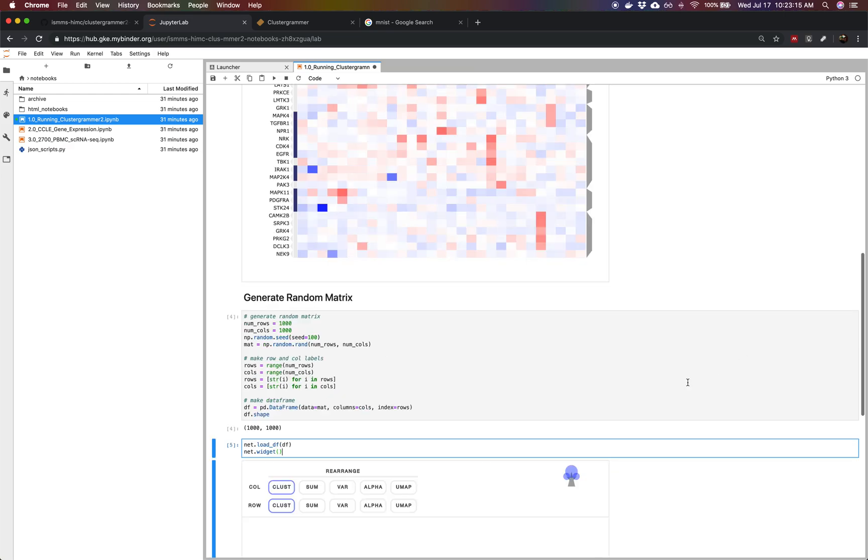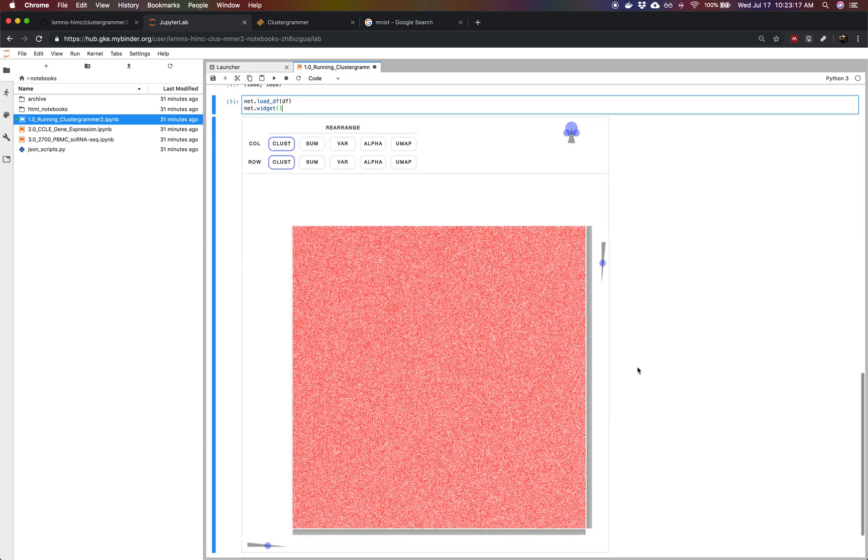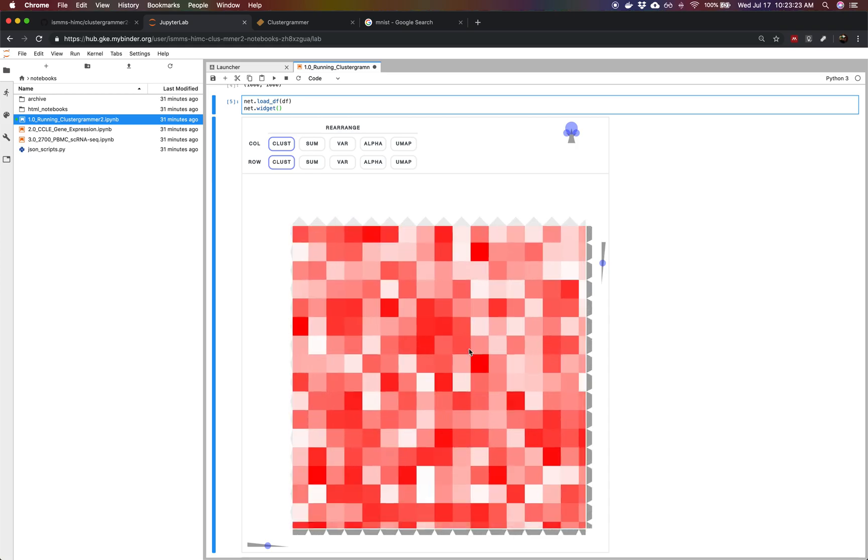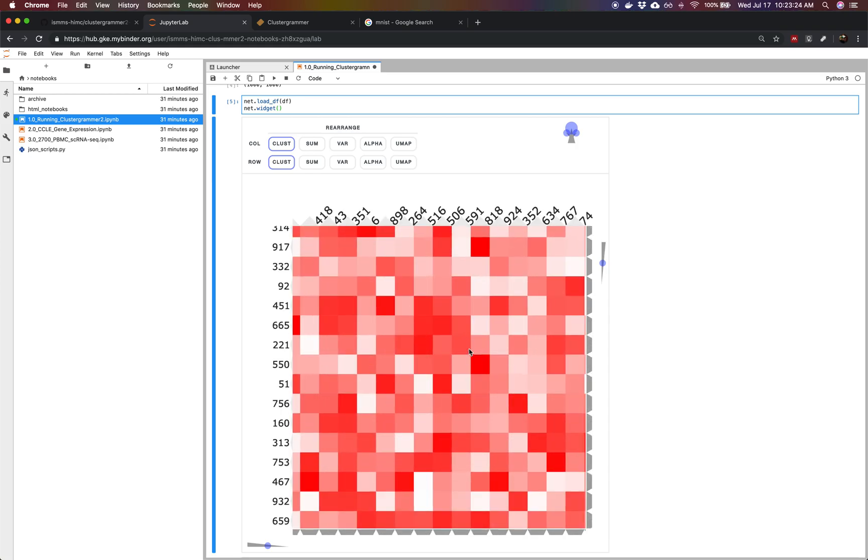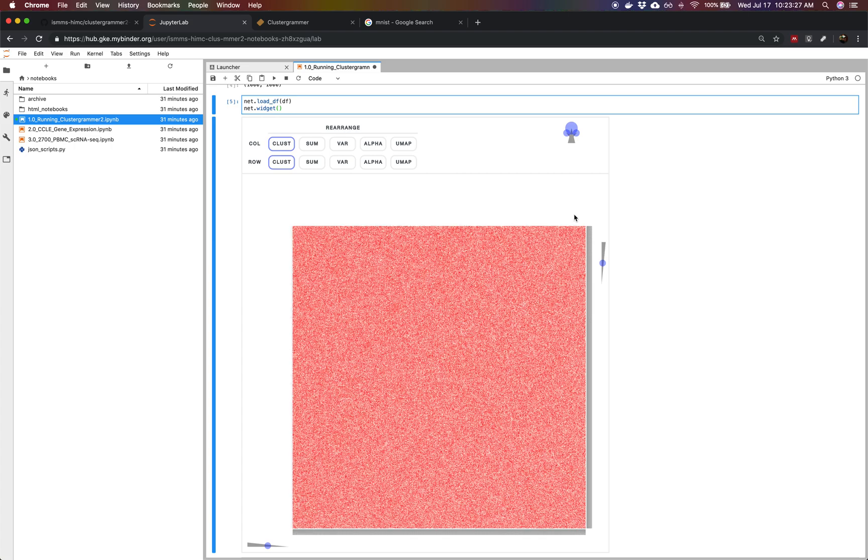We've now generated a heat map of this million data point dataset. We can zoom in and out of this random matrix and explore it in the same way we would any real dataset.